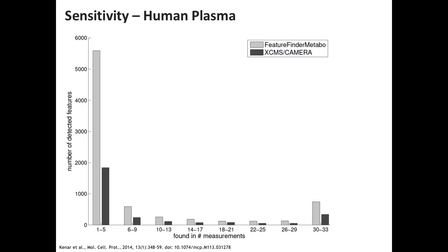When we first looked at our results, and you've seen this bathtub curve already before, we compared ourselves to XCMS and CAMERA. So this here again is the number of measurements where that was found. We had 33 runs that were basically technical replicates. And we were looking at the number of detected features. So the first thing that we were happy about is that here we had twice as many that were consistently found. And now you could argue, well, but this here is scary. That means it's just false positives. It's just picking up stuff. Could just be hallucinating features.